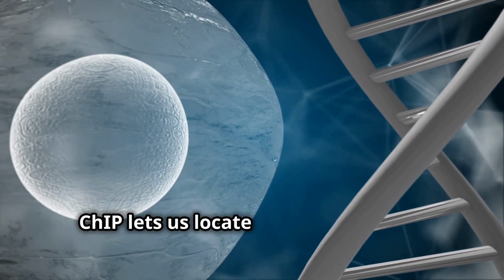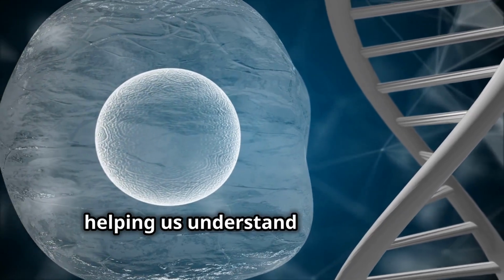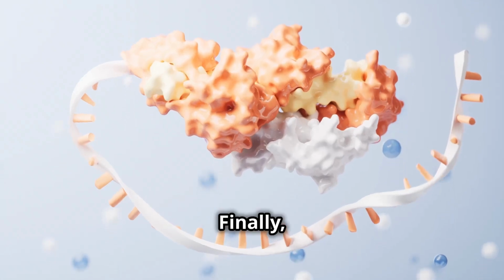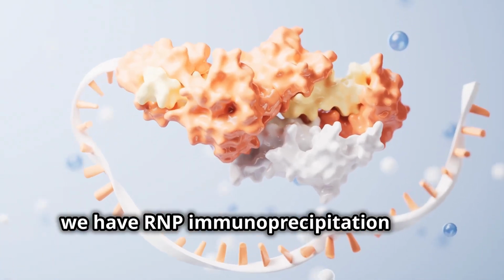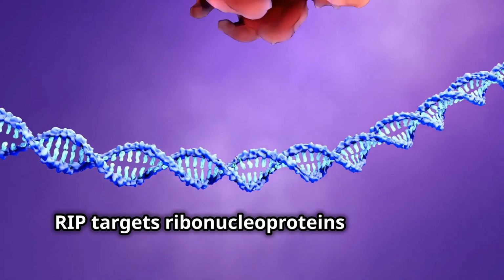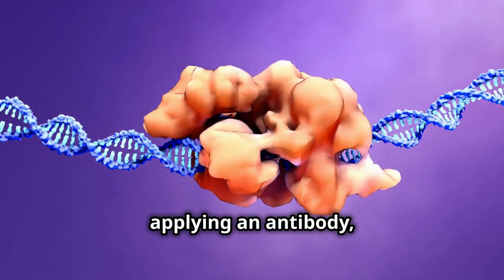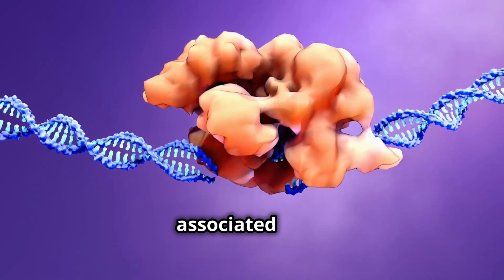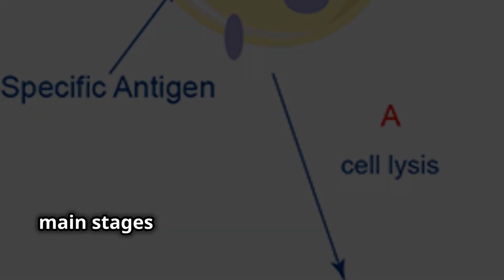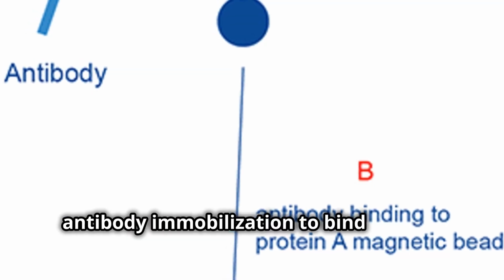ChIP lets us locate DNA binding sites on the genome for a particular protein, helping us understand protein-DNA interactions within the cell nucleus. Finally, we have RNP immunoprecipitation, RIP. Similar to ChIP, RIP targets ribonucleoproteins, RNPs, and involves lysing live cells, applying an antibody, and then extracting and sequencing the associated RNA.